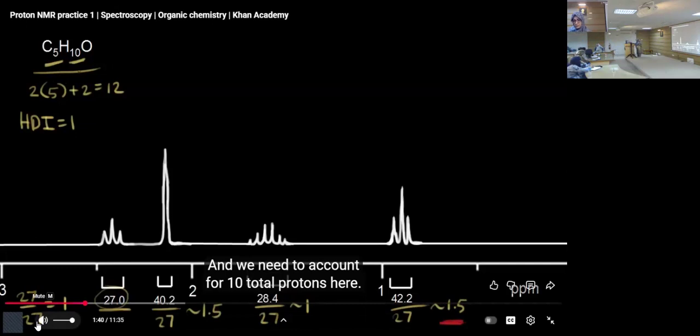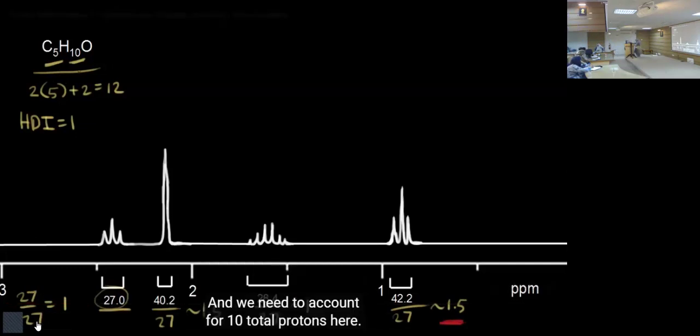Okay, so nowadays, when you run an NMR spectrum, we are mostly using processing of the spectrum, and with this processed spectrum, we usually do not have this many numbers. We have to select. Whenever you give a sample to the NMR lab, they are technicians, right?